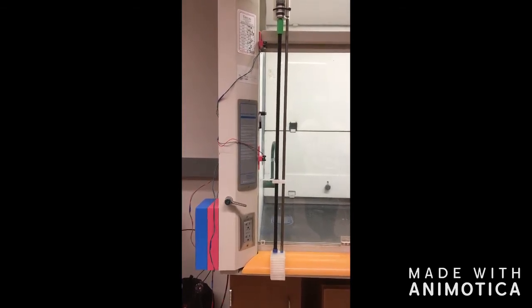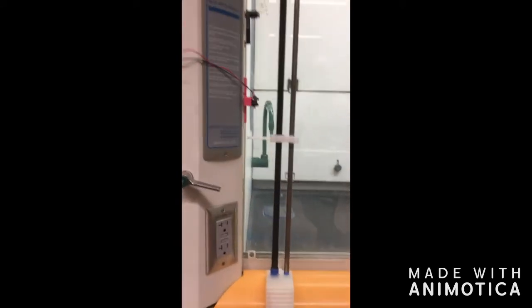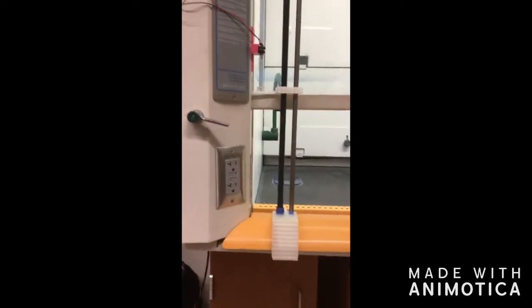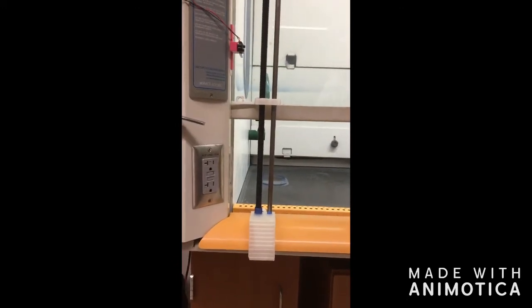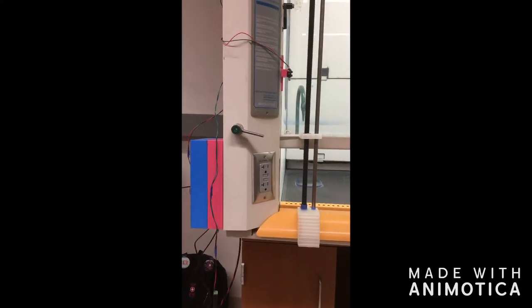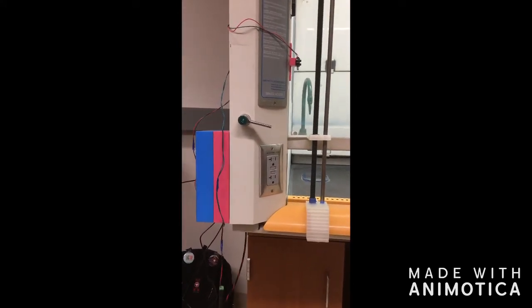We requested several undergraduate and graduate students with lab experience to test our device. We collected their feedback in a brief survey asking how the device impacted their experience of using the fume hood, whether the device interfered with their work, and general critique of the device. They found that the device was sufficiently compact and that it did not significantly interfere with their work. They were critical of the amount of noise created by the motor, measured to be approximately 66 decibels, and the overall usefulness of the device.